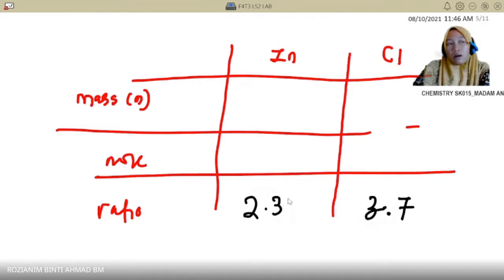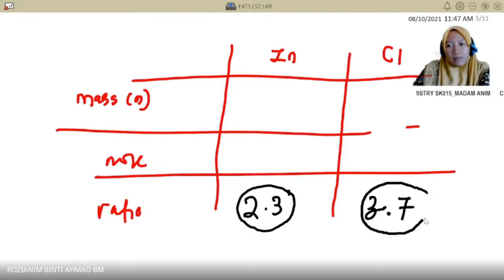Tak boleh round off, tapi kita kena darab dengan whole number to make sure kita dapat totally whole number. Tetapi from this experiment, tak perlu darabkan any whole number. Saya nak you terus je ambil nilai yang kita buat calculation ini. Kenapa? Daripada nilai ini kita boleh trace, okay, kita ada problem dari segi eksperimen.